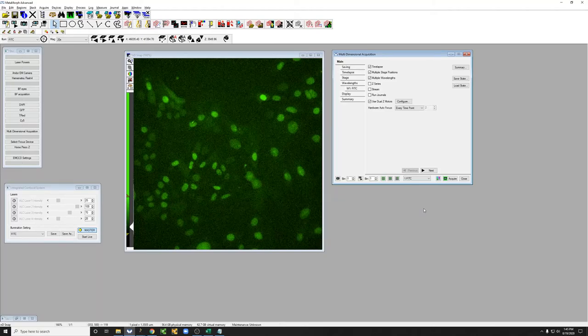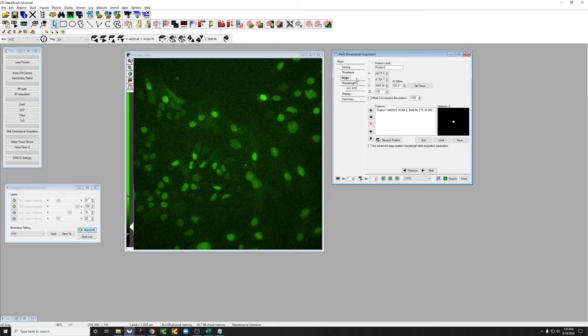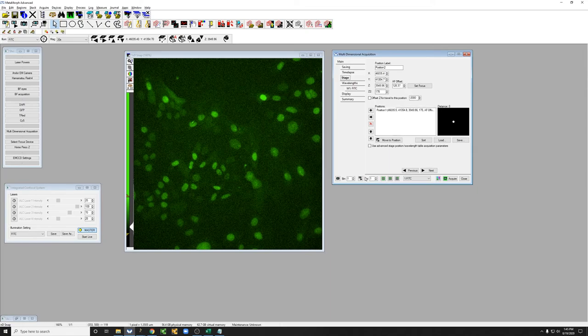So what if we want more than one position? If we want more than one position we need to have multiple stage positions engaged, but instead of having just one position we can just add others.